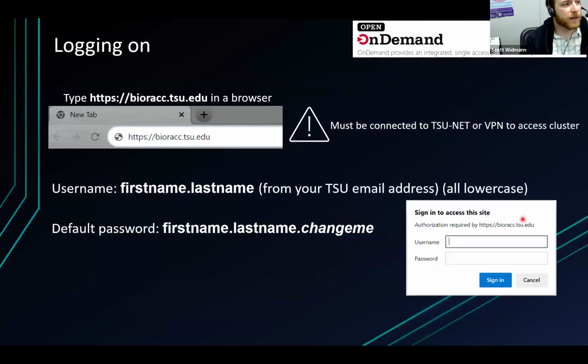And so here, this is where I would start showing you how to do the actual docking. For those of you who can log on, try to follow along. This is also recorded, and I'll share the slides with you in case you're having trouble.